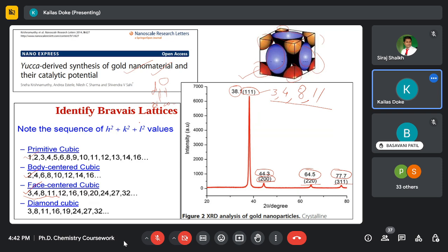We can do the calculation for hexagonal and tetragonal also, because they are also somewhat symmetrical. But the calculation is very tedious, which requires a lot of extra mathematical knowledge. After 2 hours of calculation, finally we get whether the crystal system is tetragonal or hexagonal.